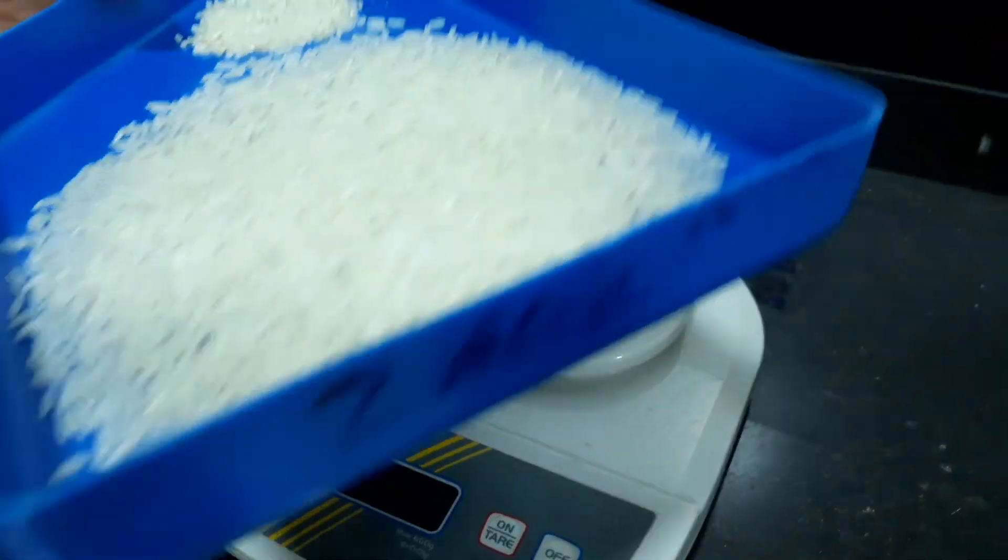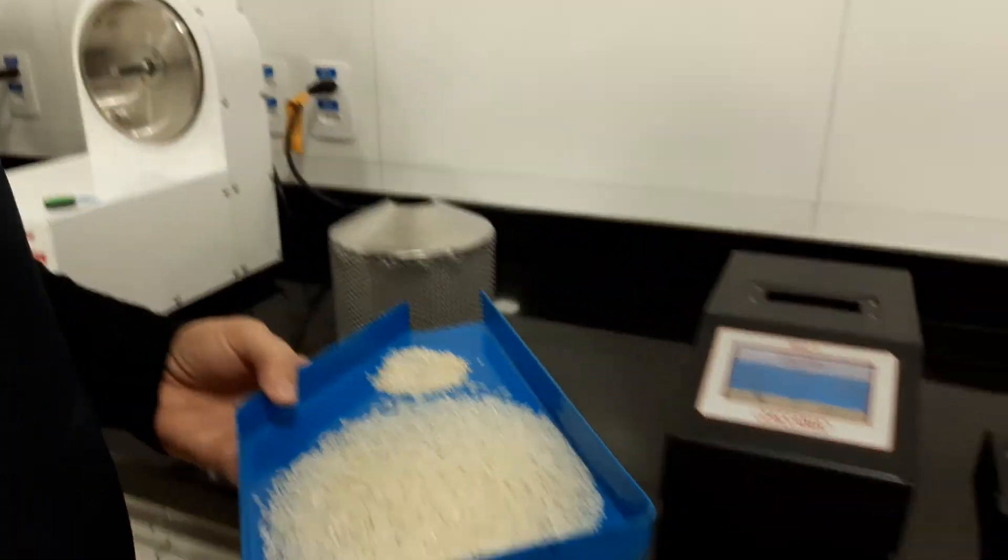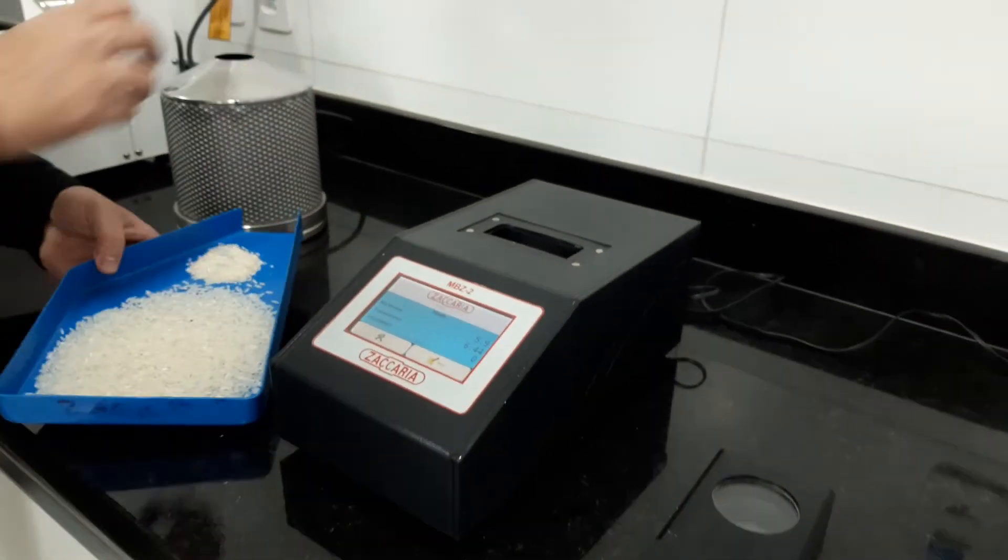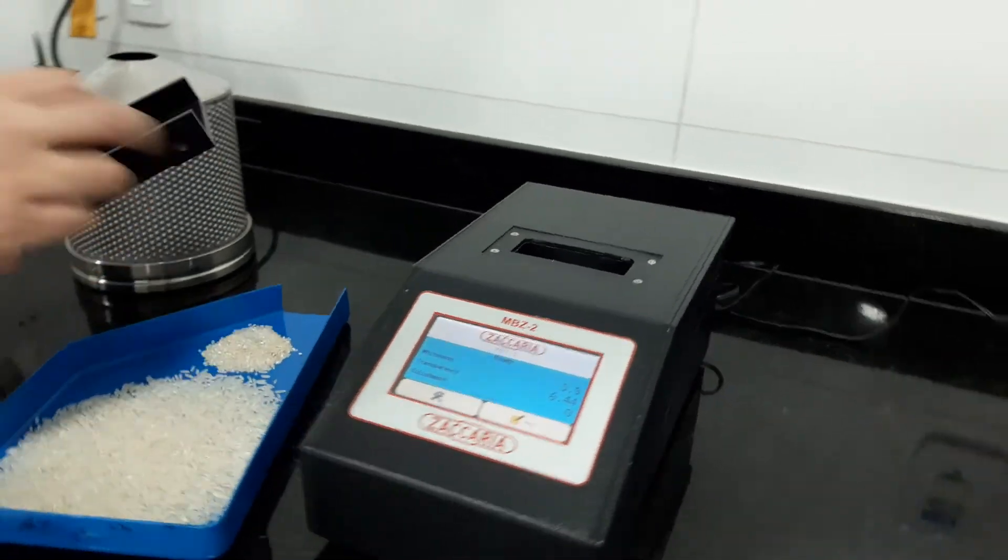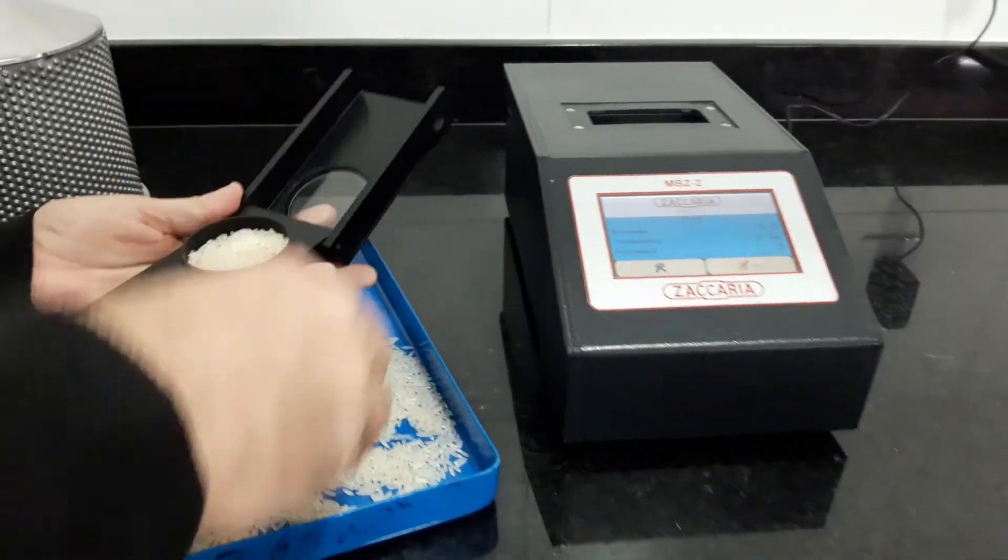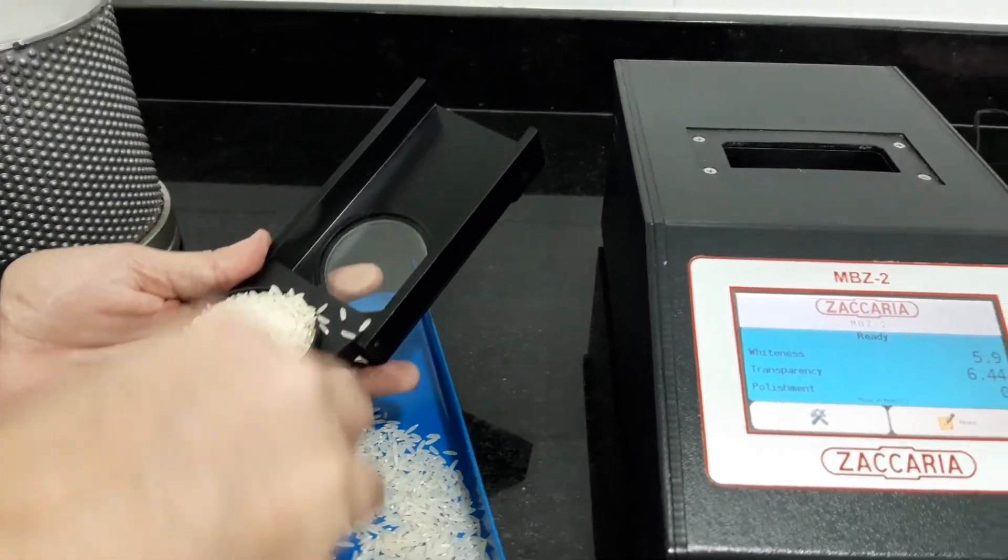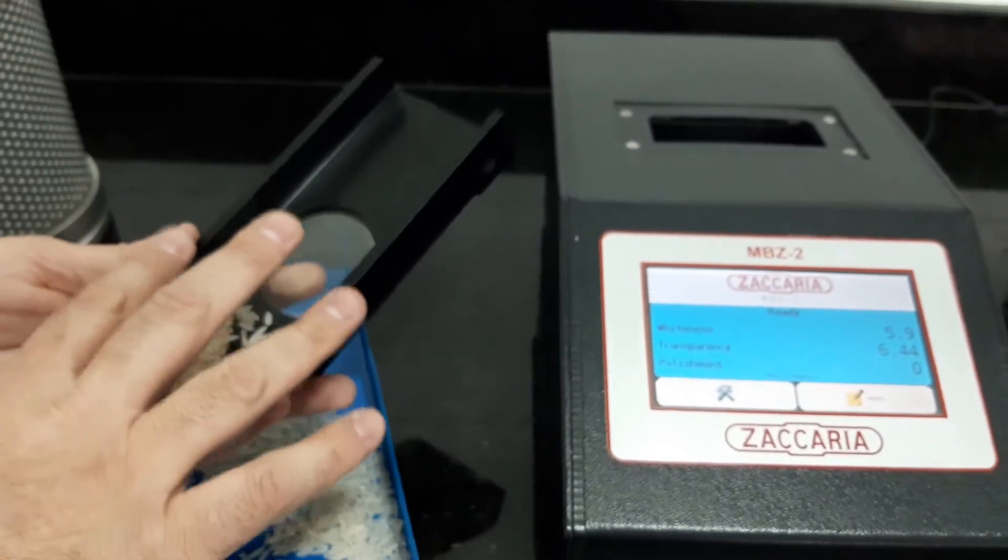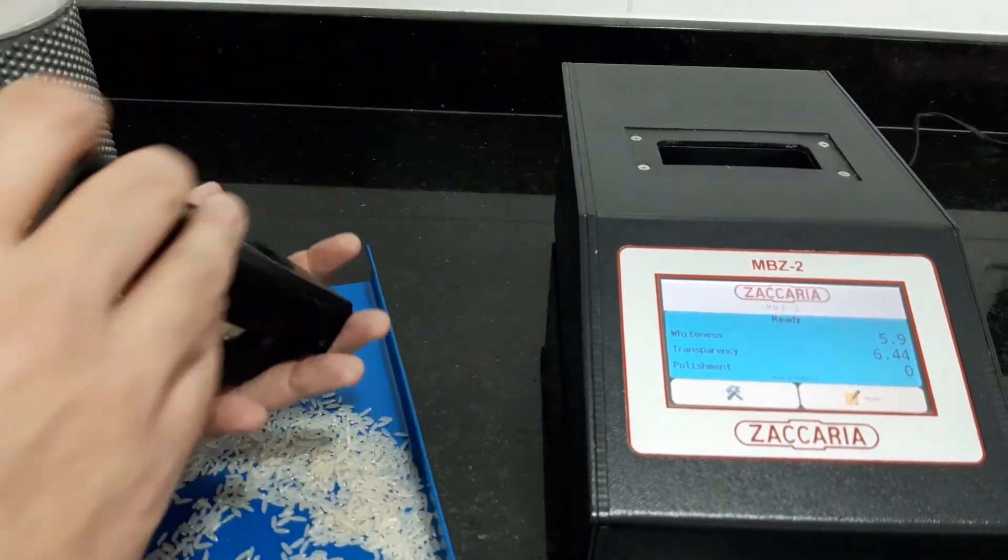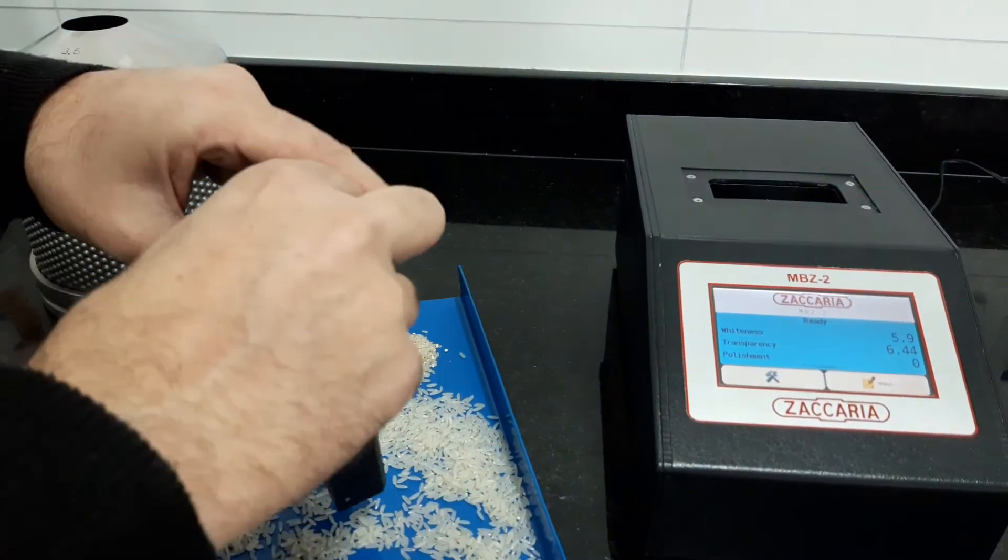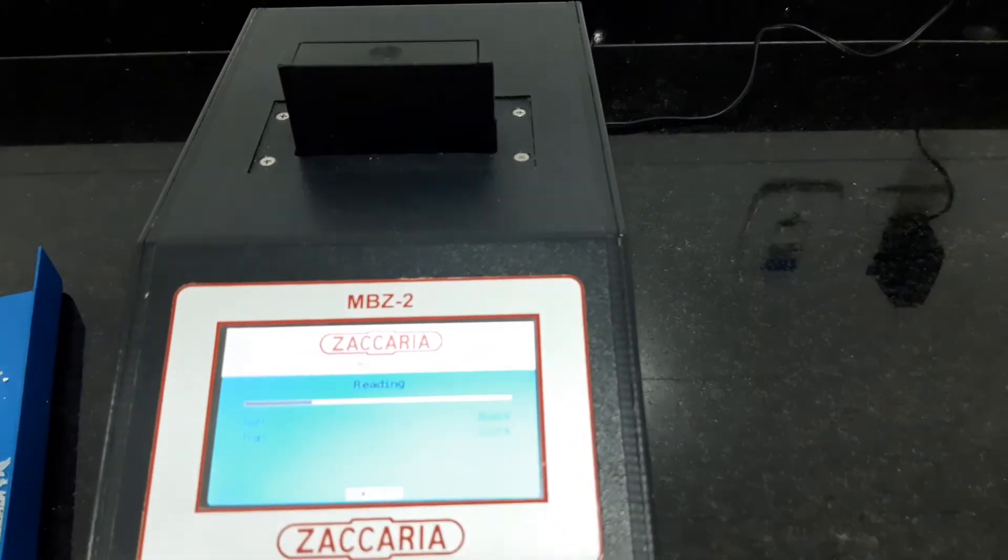And from now, we will measure the whiteness of this sample in our MBZ2, it is our whiteness meter. This is the pot, we will fill it up, the pot from here, and then put it in the machine.